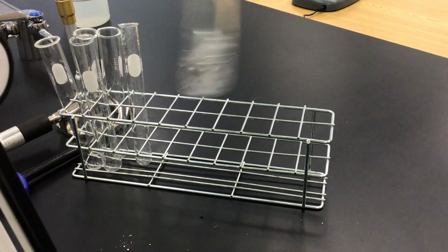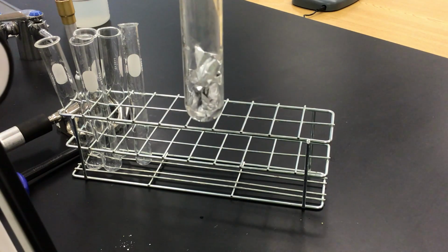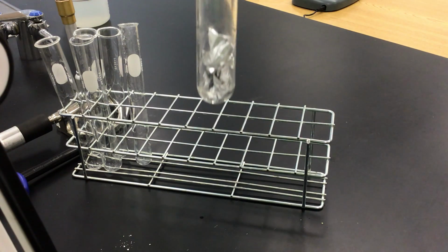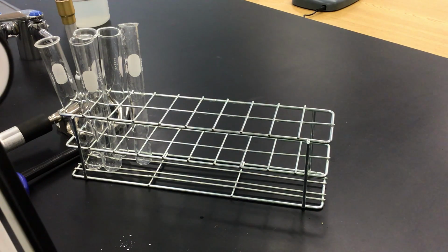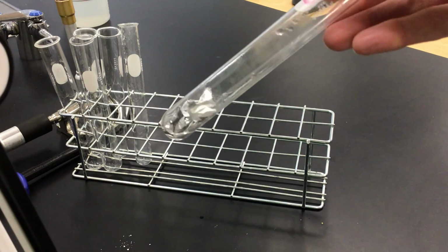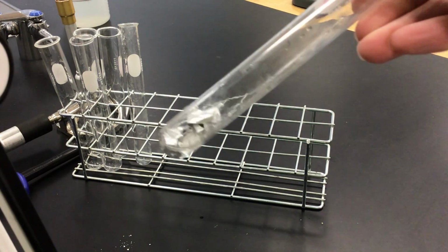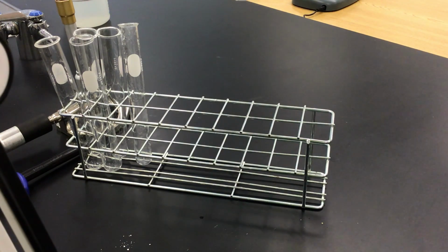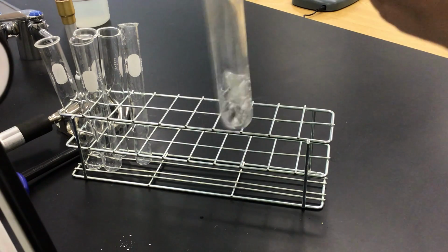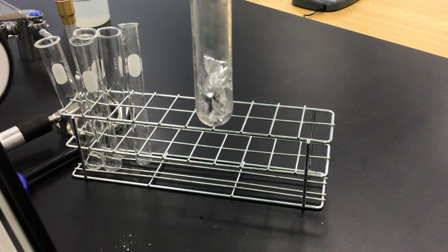Just thinking about it. Letting it interact with more of that aluminum foil. There we go.